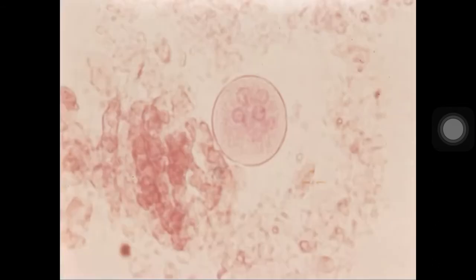So again, as what we can see here in the Entamoeba coli cyst, pero ito, 4 lang siya nucleated, pero yung kanyang karyosome dito, eccentrically located. Tapos uneven yung distribution ng kanyang peripheral chromatin. Kasi mapapansin mo, kung evenly distributed yung peripheral chromatin, kitang-kita mo yung membrane ng nucleus.